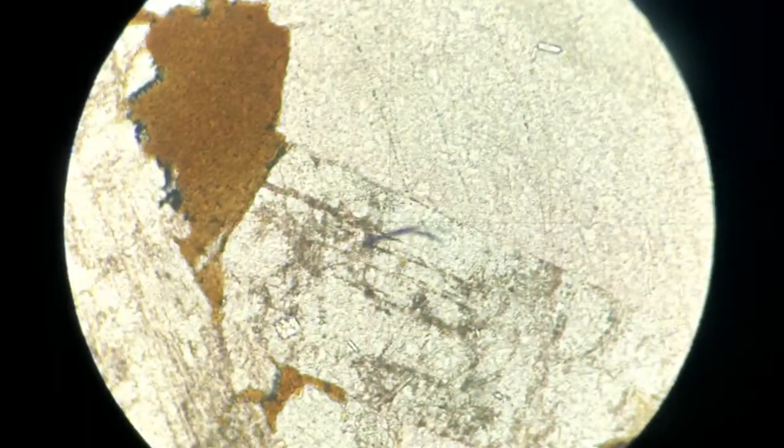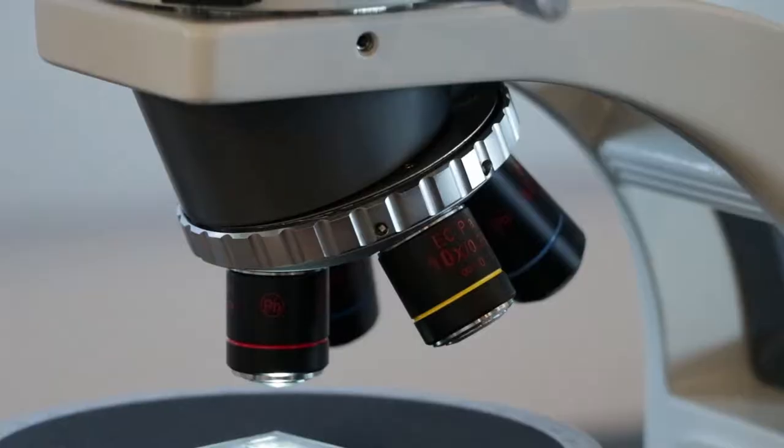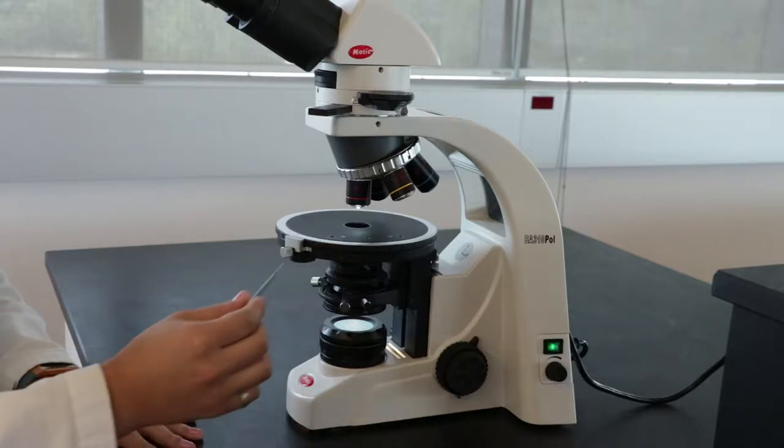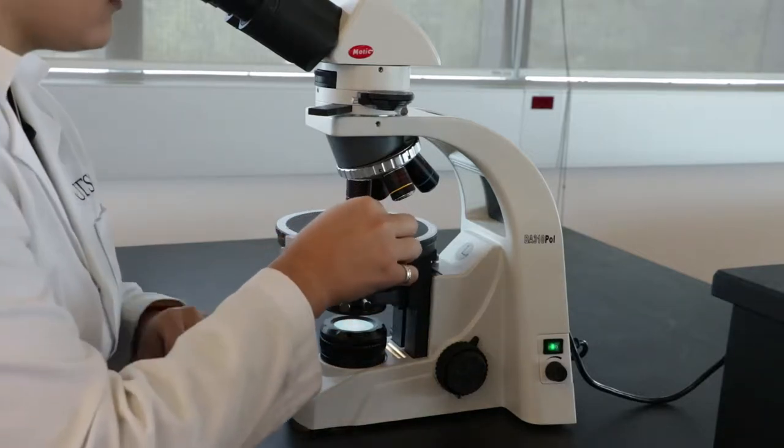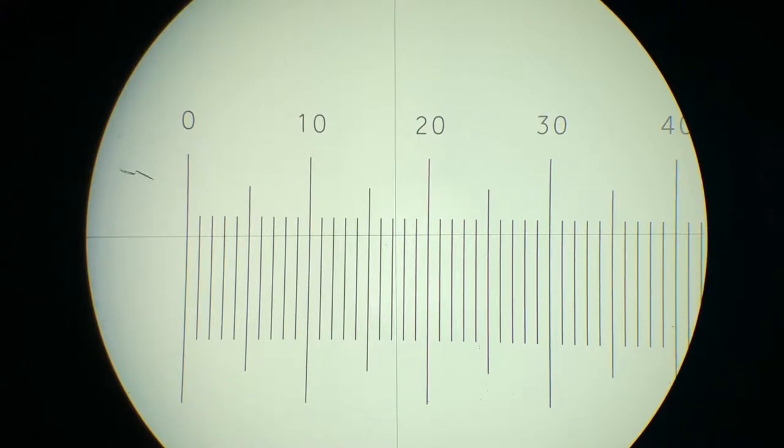This helps us estimate the size of individual minerals during thin section microscopy. To do this, first ensure that the 4x objective is in place and put the micrometer slide on the stage. Center and focus the scale so that you can read it through the eyepieces.